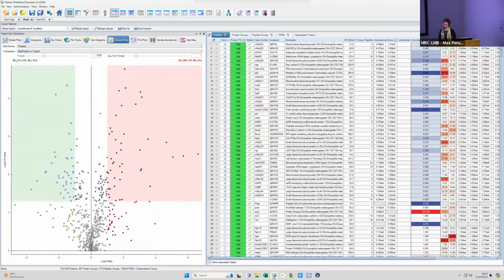This is actually the non-specific binders, because these are the proteins that are more abundant in your control. So if, by any chance, I was to do a follow-up analysis on this, I could use this information. I can extract the FASTA database and use these to mark on a follow-up analysis. I can use these to mark them as non-specific binders because they are more abundant in the control.